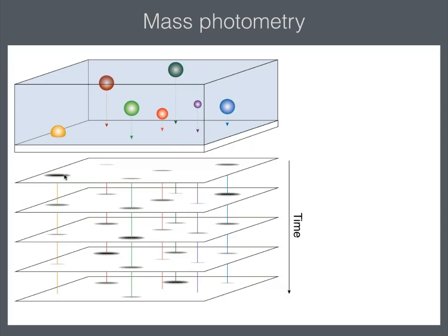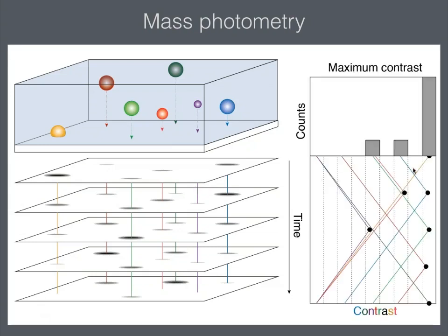So if we measure and record the contrast in each of these frames, in other words, contrast over time for each of the individual molecules we detected, all color-coded, then if we follow some of them individually, this orange one, the signal just decays with time.